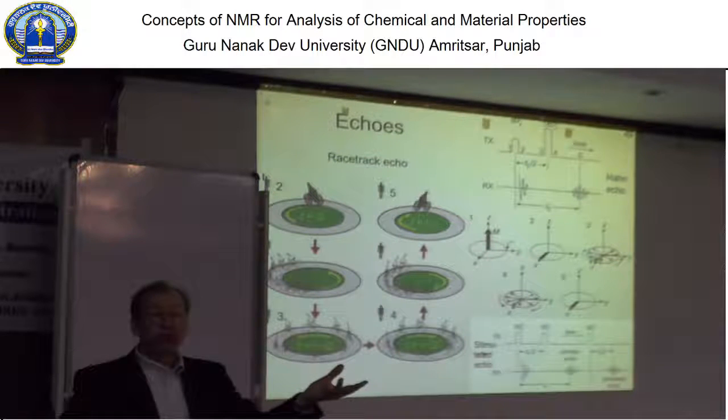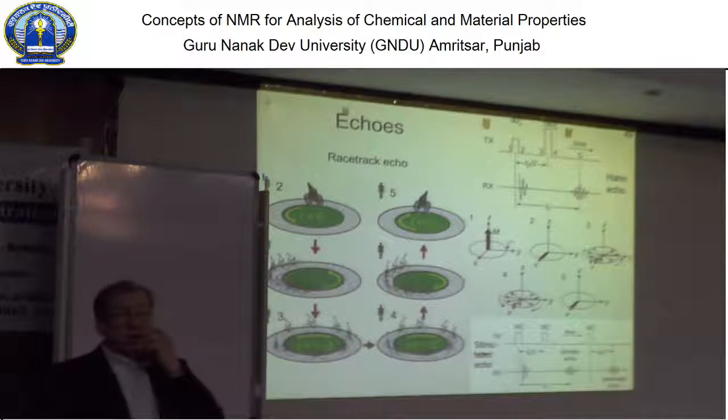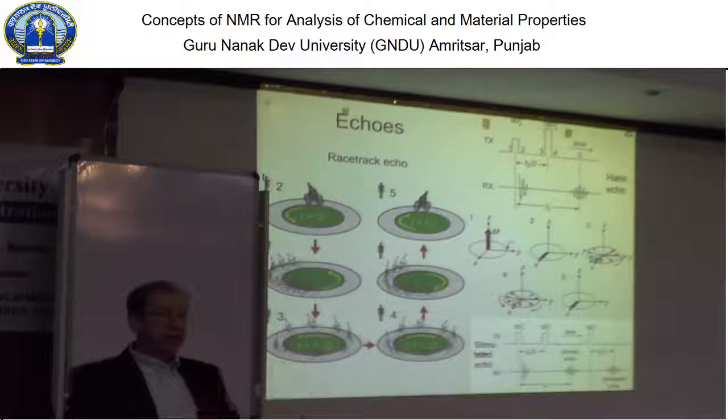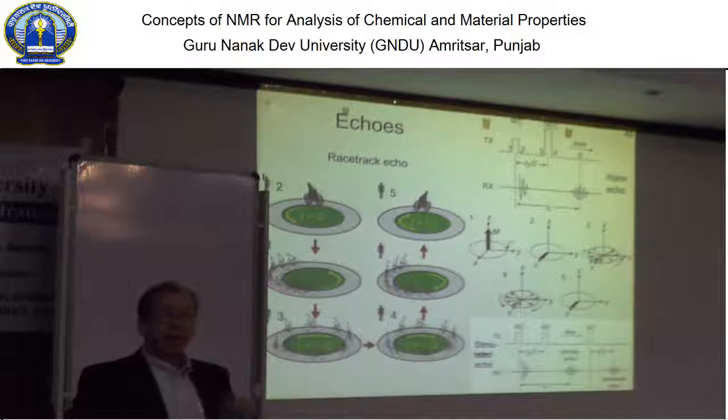This is what the geophysicists exploit when they want to know what type of fluid is in my rock. Is it oil, or is it water, or is it methane? So they can use T2 for that. And again, also, for instance, rubber are cross-linked macromolecules. If the cross-link density is high, then your rubber is very rigid, so it feels more like a solid. If the cross-link density is low, then your rubber is soft, you can stretch it easily. And T2 scales with the cross-link density.